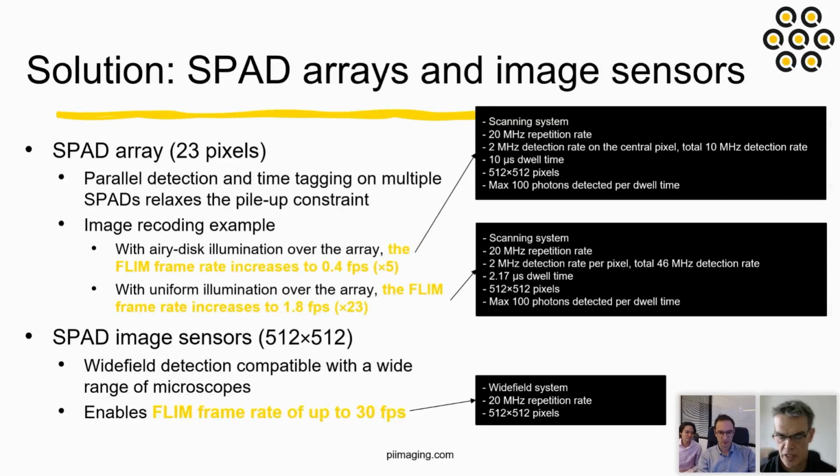So I'm just going to add to that: it is true that you only capture a single photon in a single time point, right? As you stated, it is digital. You find a photon, or you don't, and within that very, very short exposure time, down to 6 nanoseconds, you're only going to detect 1 photon. For 1 pixel, correct, yes.